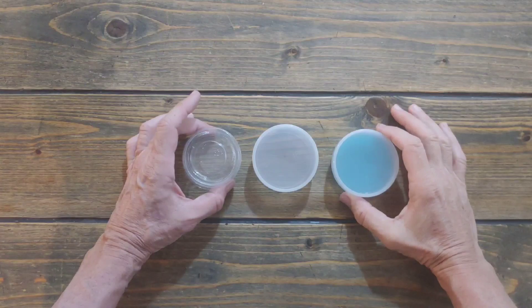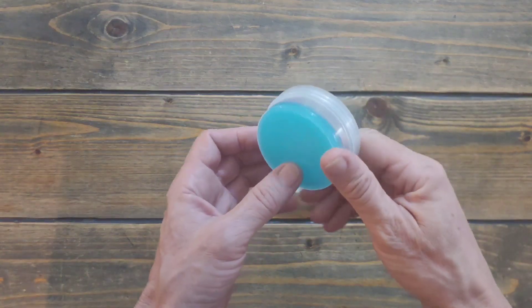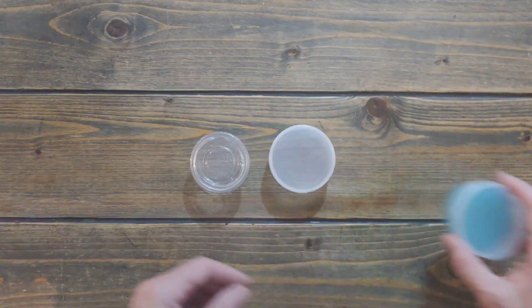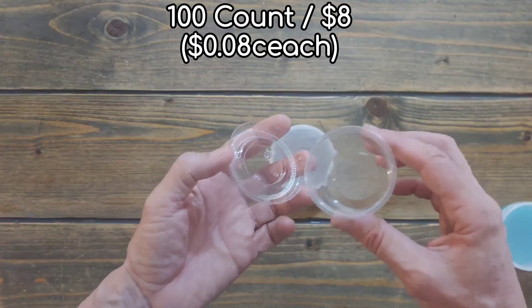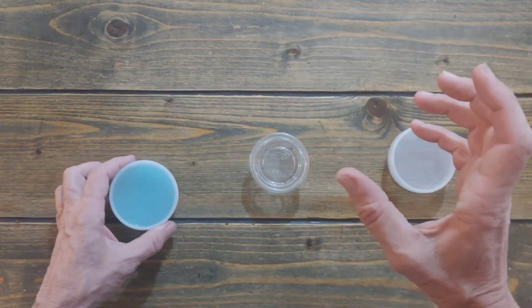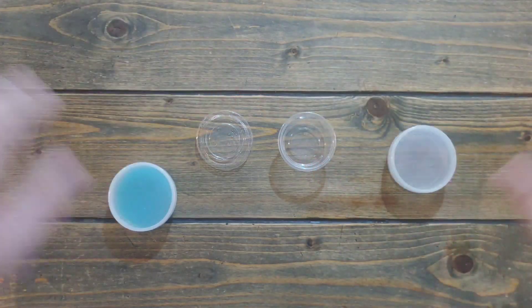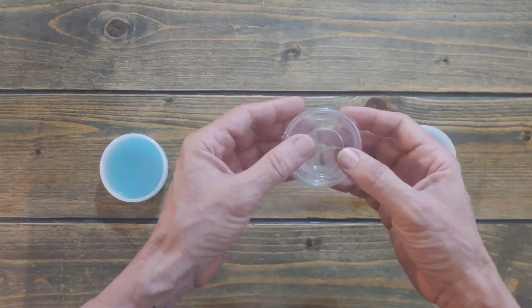We're going to talk about agar cups and different options. The ones I like the most — you can see my video on how to make and sterilize them in the pressure cooker. Now people are asking about the ketchup cups or condiment cups. I used to use these first, used them for a while, they work great. The difference is that you have to sterilize your agar in a jar, and after the agar is sterilized you pour it outside afterwards in a still air box or in front of a laminar flow hood.